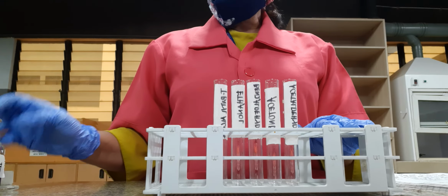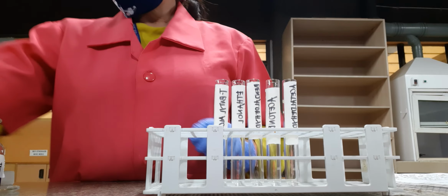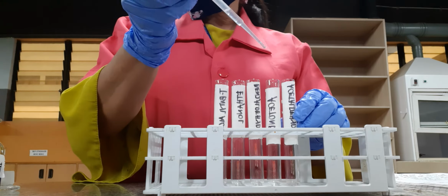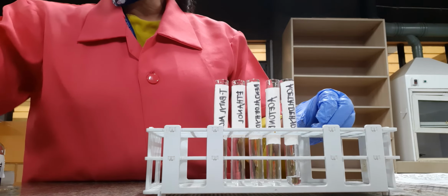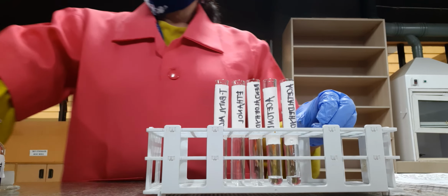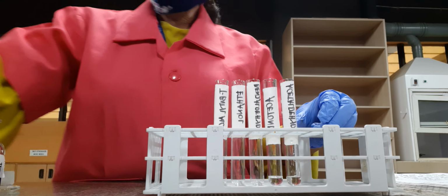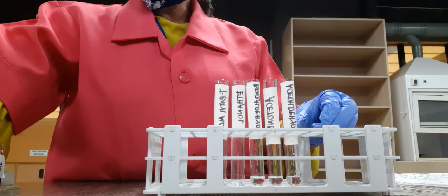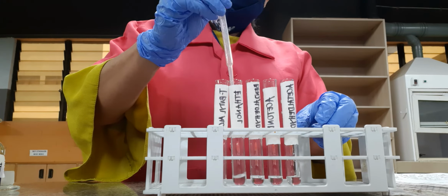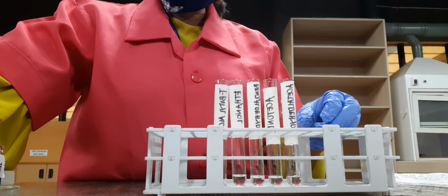So therefore, we'll have the same volume of 1 ml of acetaldehyde, and then 1 ml of acetone, 1 ml of benzaldehyde, and then 1 ml of ethanol, and 1 ml of tertiary butyl alcohol or tertiary butanol.